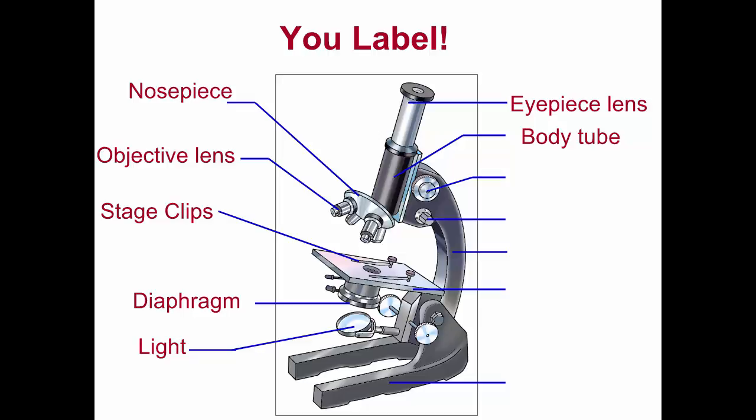Then we have the knobs that allow us to focus our image. Our microscopes have both built into one. But on the microscope in the diagram, they're 2 separate knobs. One larger, one smaller. The larger one, Emily? The coarse adjustment. The smaller one? Madeline? The fine adjustment.